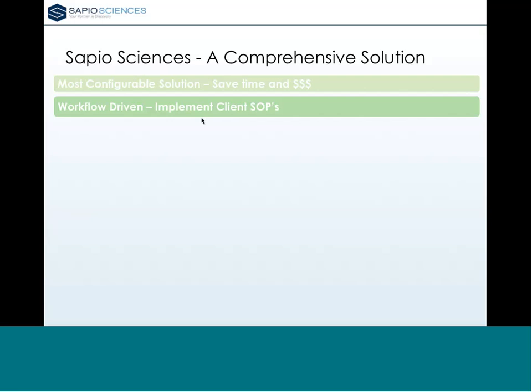You might have noted that there's roughly 25 or 30 users using the LIMS at Sloan, actually more than that, I think, on the research side, and often concurrently. So you have to have a system that's going to scale in volume and in concurrency of users. And we've had a lot of experience making the workflow engine scale. This is where the lab techs are going to spend a large amount of their time. So the third part of it, and why having experience is important, is also in how you build these workflows.